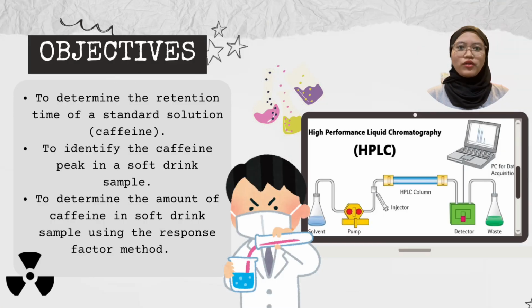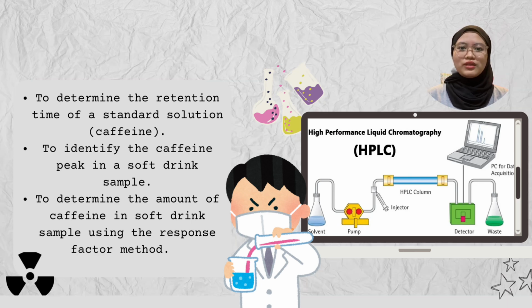Next, the objective of this experiment is, first, to determine the retention time of a standard solution, caffeine. Second, to identify the caffeine peak in a soft drink sample. And lastly, to determine the amount of caffeine in a soft drink sample using the response factor method.